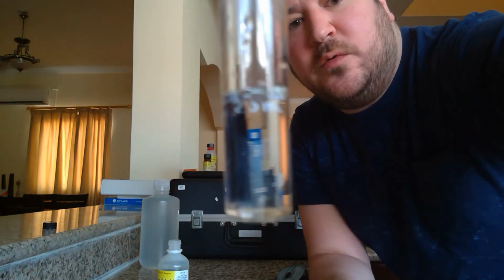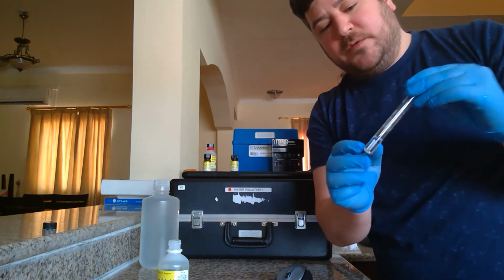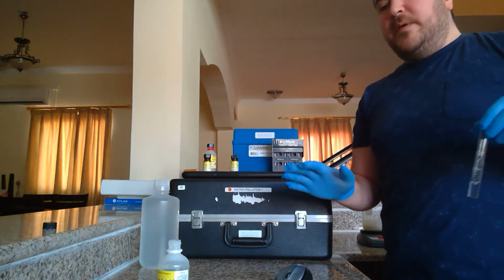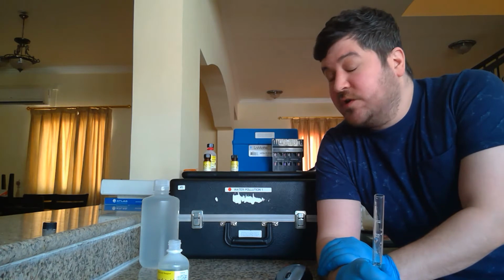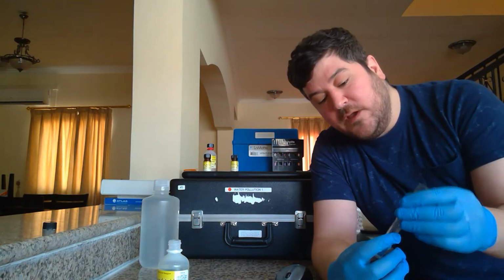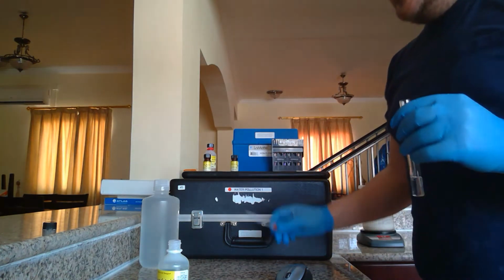So I have this made up, or mixed, to the 2.5 milliliter line. These test tubes have been used for a while, so the numbers are fading off a little bit, but it is to the 2.5 milliliter line. The next step in the procedure, it's only a 6-step procedure, which I will share online, is to fill this to the 5 milliliter line and wait 2 minutes.